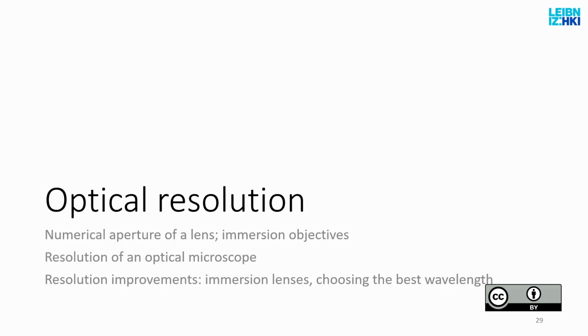Let's say I have a muscle cell with 3 nuclei. Can I see them as 3 nuclei if they are close to each other, or do I just see a big blob in my image? Or I have microtubules, a micrometer or so, or I have mitochondria, micrometer-sized, inside.